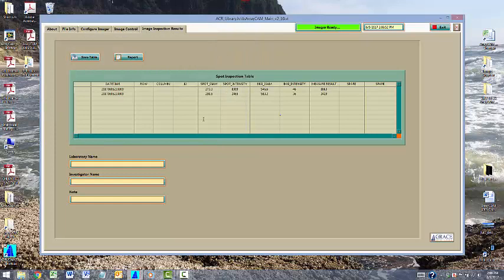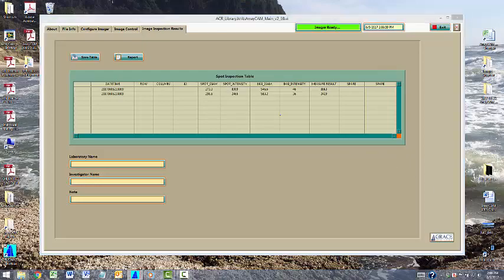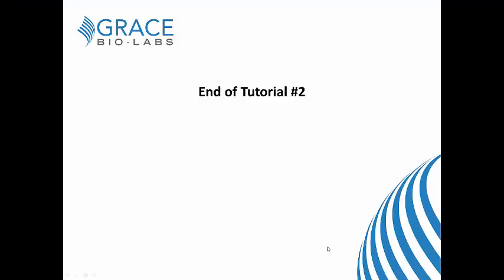This concludes the second ArrayCam tutorial. We hope you found this tutorial helpful. The next tutorial covers the beginning steps to using the automated analysis method.